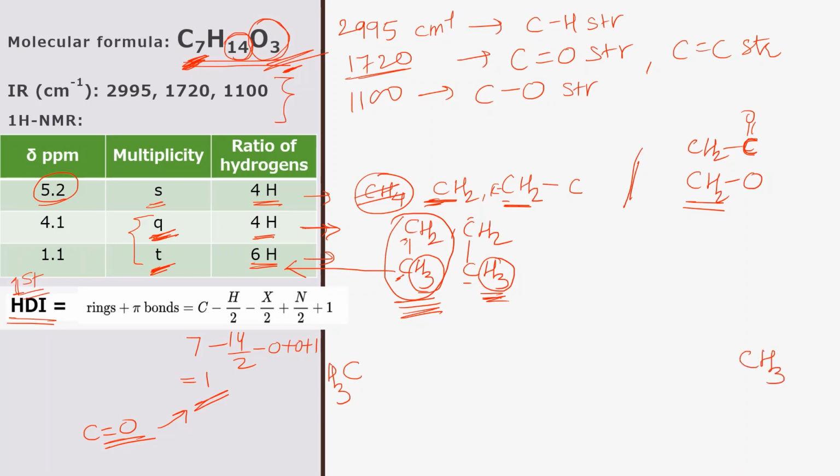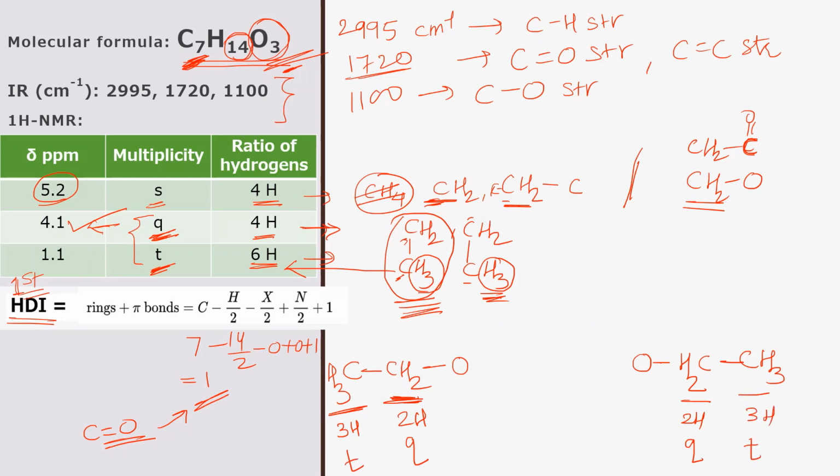Okay, now I know that CH2 and CH2 is present over here, and this CH2, see this CH2, the peak for these hydrogens is here, and if you see the delta value, that is also 4.1, so quite downfield. That means maybe one oxygen is present over here. So that way these two hydrogens giving quartet is satisfied with the data. Again, same here, these two hydrogens giving quartet is satisfied with the data, and these three hydrogens giving triplet, here also these three hydrogens giving triplet, that is also satisfied with the data.